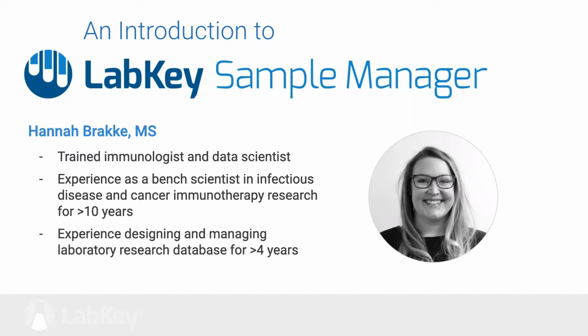I started out dissecting mosquitoes for malaria research and then collecting samples from different animal models and developing a program that received and processed human samples from phase 1 immunotherapy clinical trials. I've had my fair share of sample collection, processing, and analysis in the lab. When I joined Labkey, I was asked to share my experience with our team to help Labkey create and launch a new product, Sample Manager. For me, getting to be a vital part in designing a software solution that will actually help scientists perform work rather than hinder it has been a really exciting journey, and I'm excited to share it with you today.